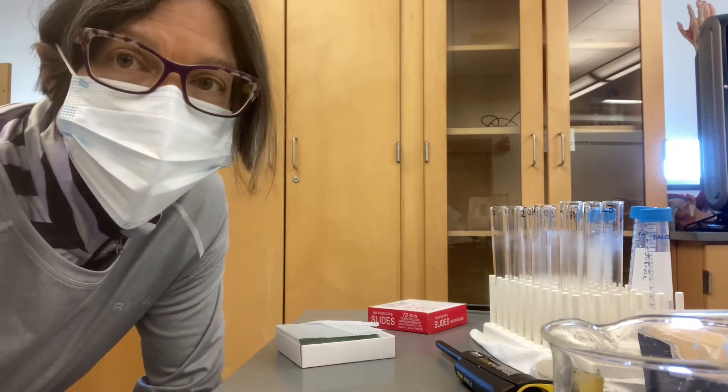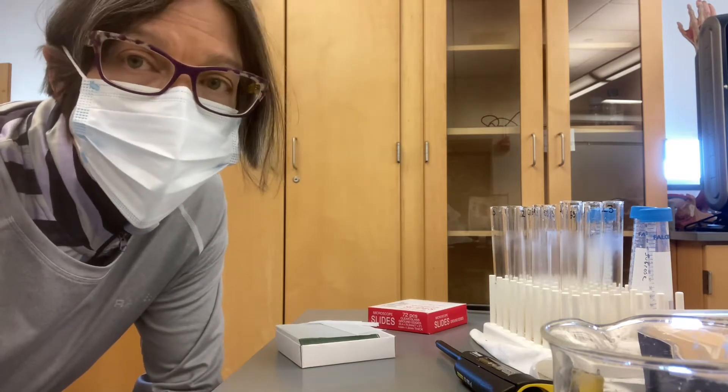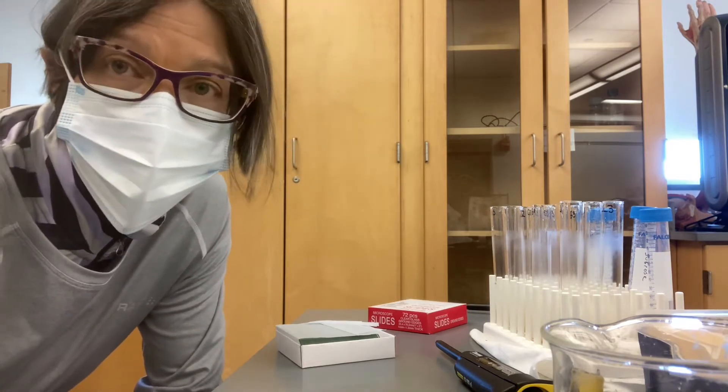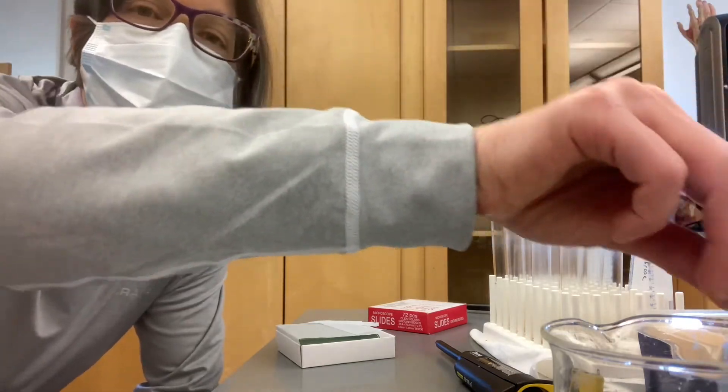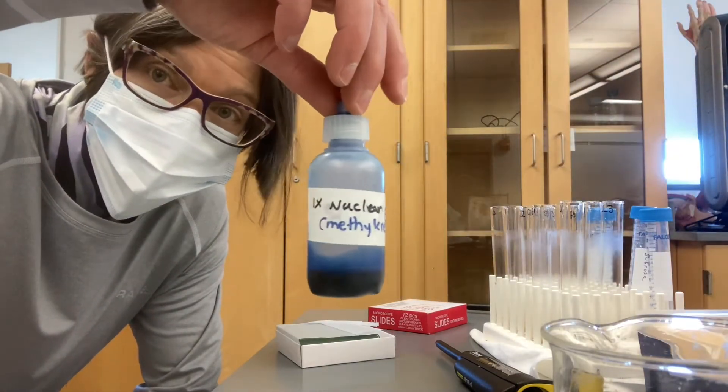So in this assay, you take yeast cells and you make a wet mount and then you stain the wet mount using a dye called methylene blue and it's name, it is blue.